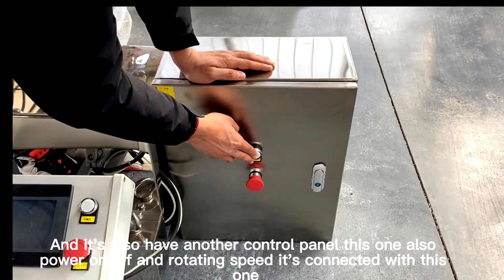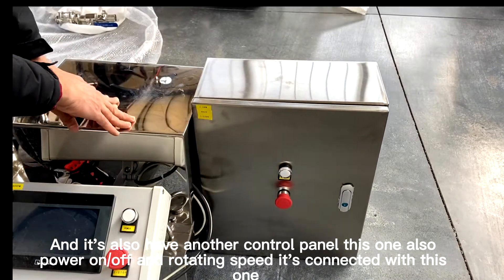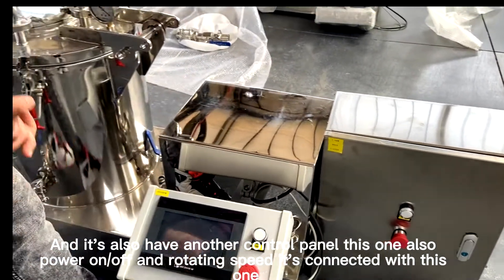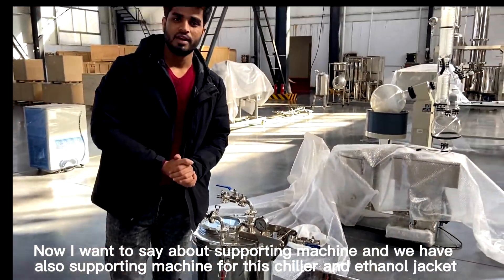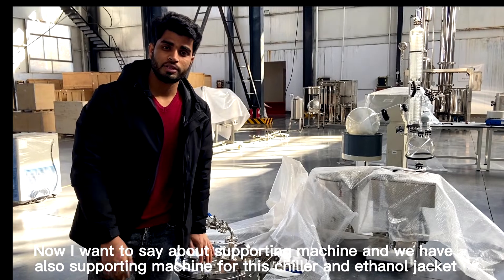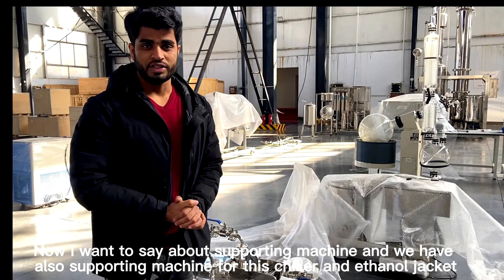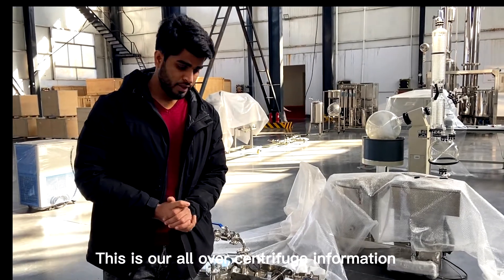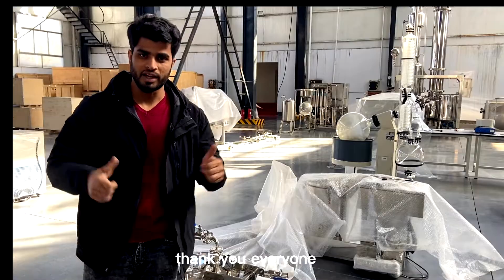I also want to show the supporting machines — we have a supporting machine for the chiller and the ethanol jacket. That is all the overview of the centrifuge information. Thank you.